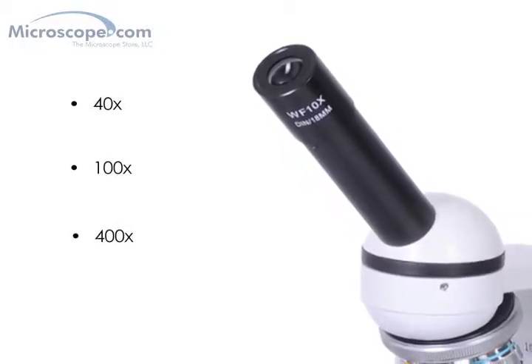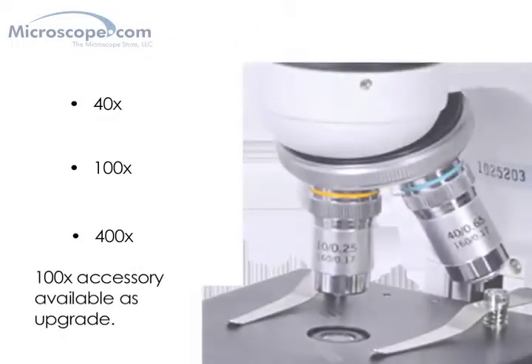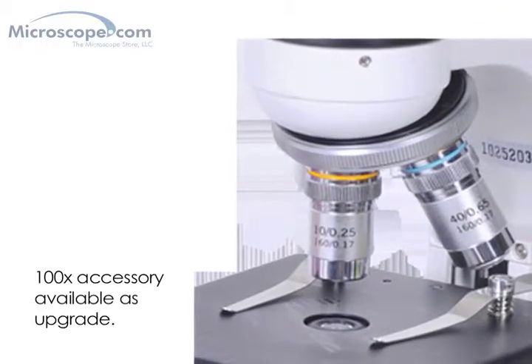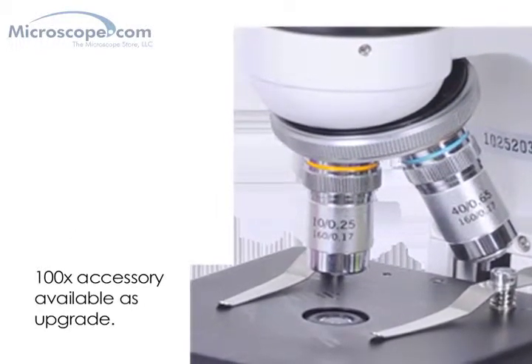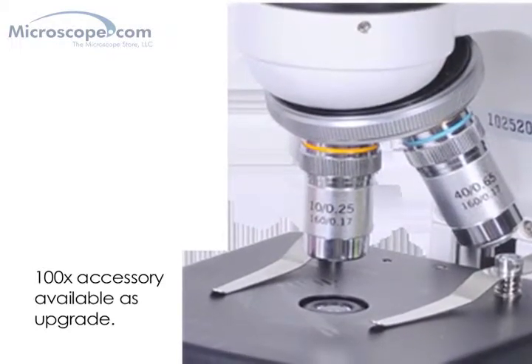and 400x magnifications. A 100x objective is available as an upgrade accessory for those who may need a full 1000x magnification. The nosepiece of the microscope has four objective ports, so the 100x objective can be mounted without removing another objective lens.